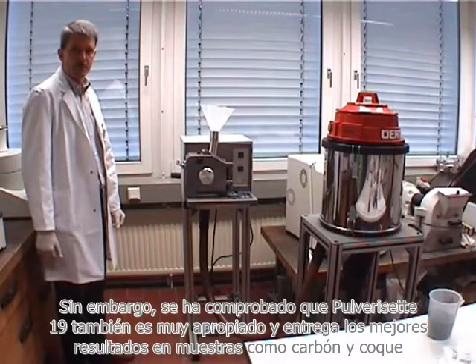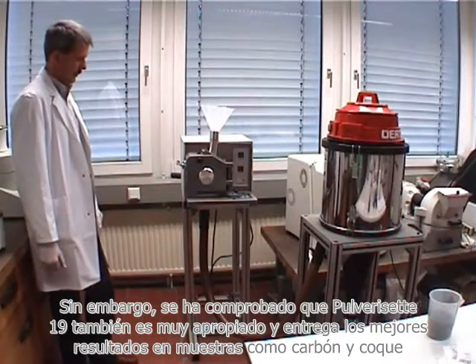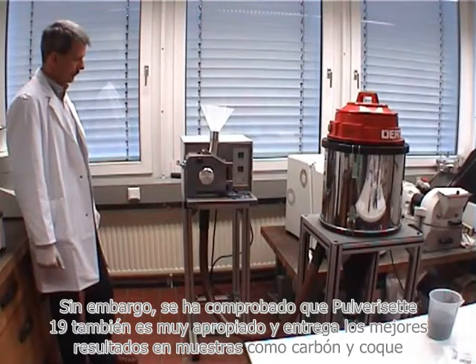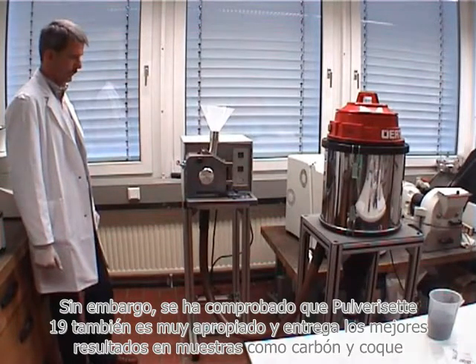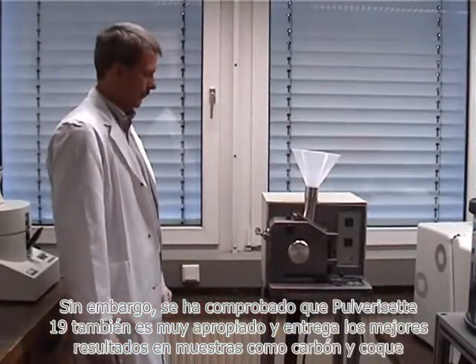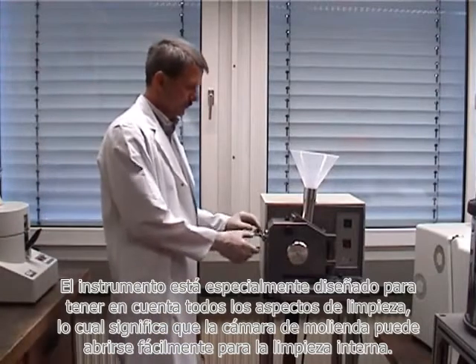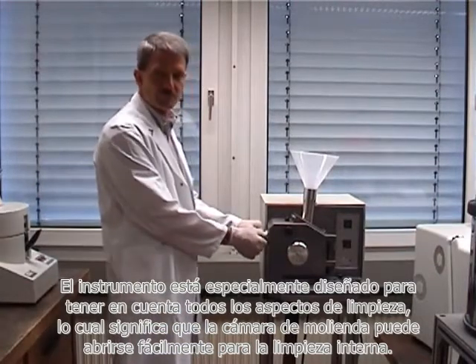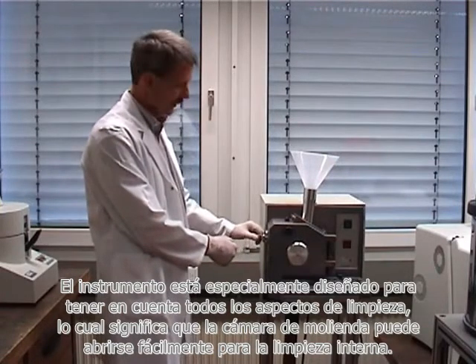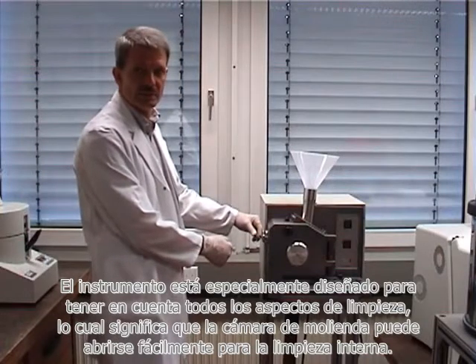However, it has proven that the Pulverisette 19 is also very well suited and gives best results for samples like coal and coke. The instrument was especially designed to take care of all cleaning aspects, which means that the grinding chamber can be easily opened for inside cleaning.